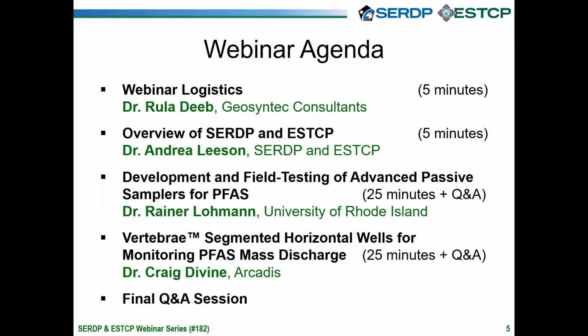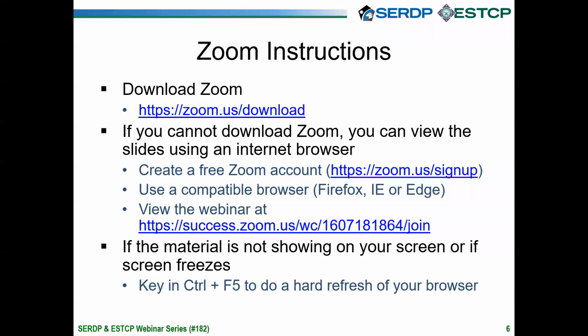This webinar focuses on DoD-funded research efforts to develop innovative tools for PFAS sampling and monitoring. First, Dr. Rainer Lohmann from the University of Rhode Island will discuss his work on developing and testing PFAS passive samplers in groundwater, surface water, and pore water. Second, Dr. Craig Devine from Arcadis will talk about the assessment of a novel multi-port well system to help in PFAS site characterization efforts. Both presentations will be followed by a brief Q&A session, and we will conclude the webinar with a longer Q&A session.